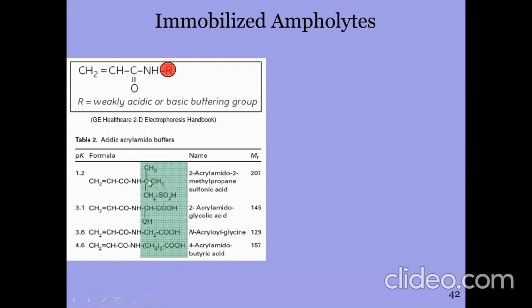This is the acrylamido group, and this is propane sulfonic acid.